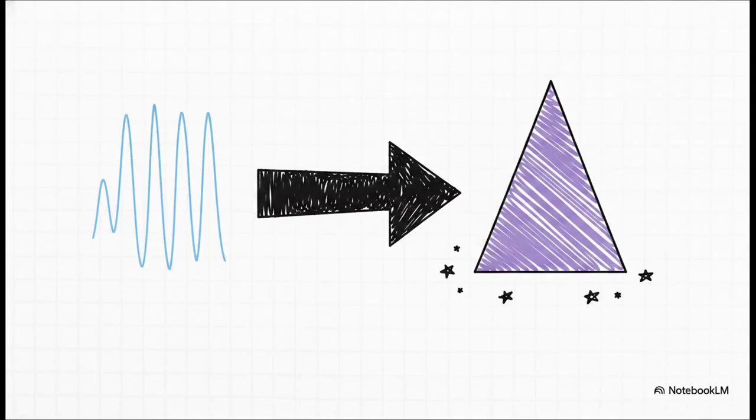Now, relying on an isotope this rare definitely throws some major hurdles our way. First off, because of its low natural abundance and a lower gyromagnetic ratio, carbon-13 signals are roughly 6,000 times weaker than the proton signals you're probably used to seeing in standard hydrogen NMR. 6,000 times! Plus, the chances of finding two carbon-13 atoms right next to each other in the same exact molecule, practically 0. No single molecule is giving you a complete spectrum.